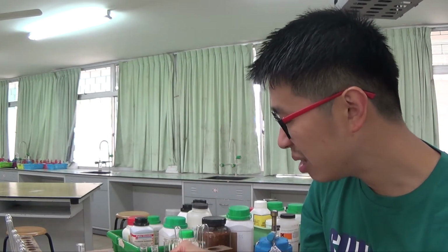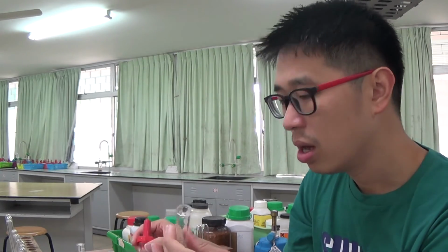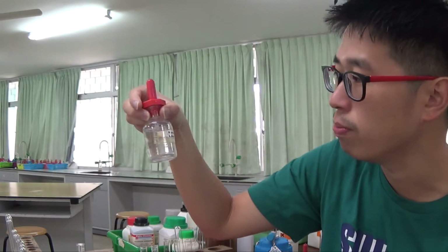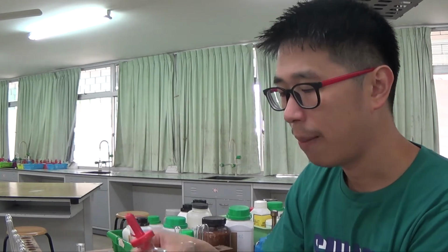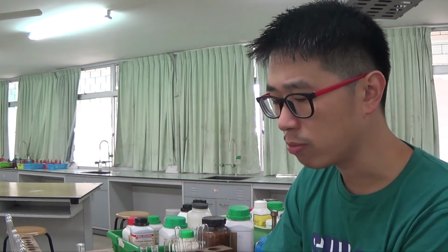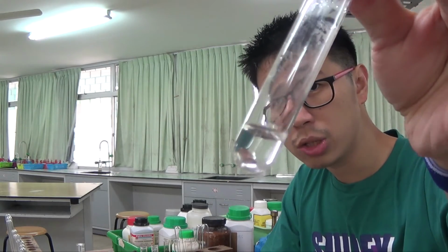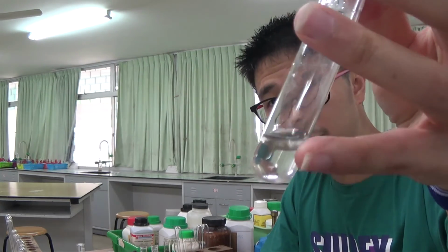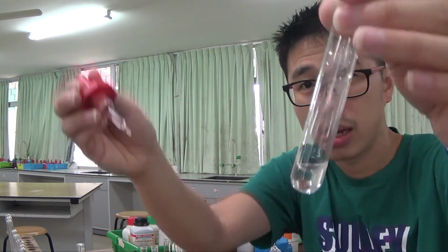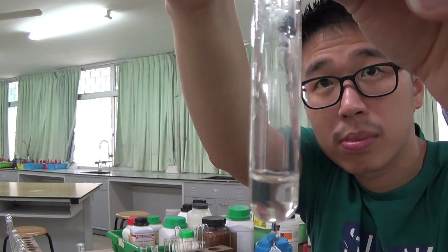And the other ion that I'm testing for is sulfate. So I'll use something called barium nitrate. This is Ba2 plus NO3 minus twice, because plus 2 must be balanced by minus 2. So I need 2 of the nitrate. Barium nitrate is Ba2 plus NO3 minus twice. Sometimes we use barium chloride. Colorless solution, this was aluminium ammonium sulfate. But remember, when you test for something, you're trying to find the identity of the cations and anions, so you don't really know the identity. Okay, so let's see what happened.